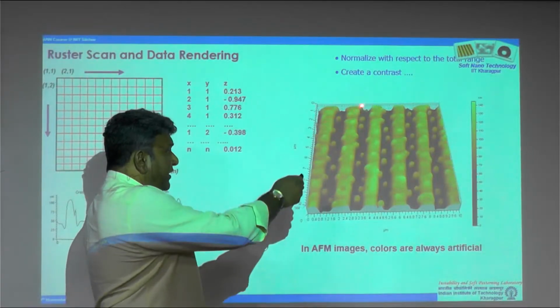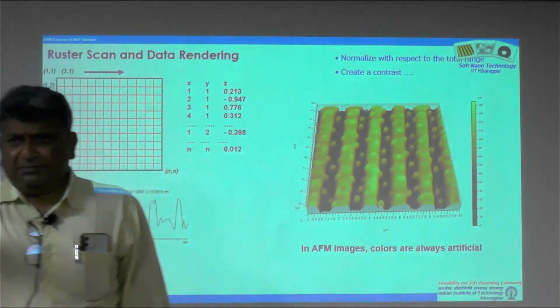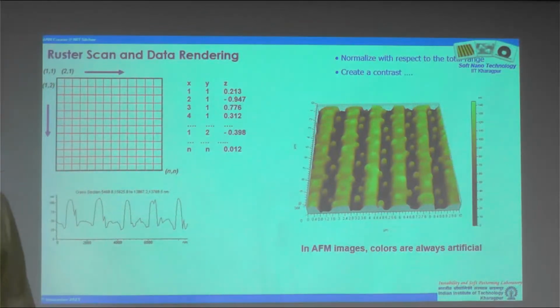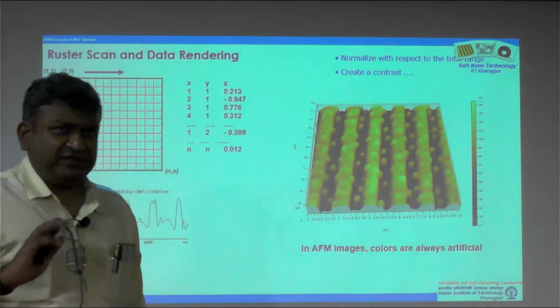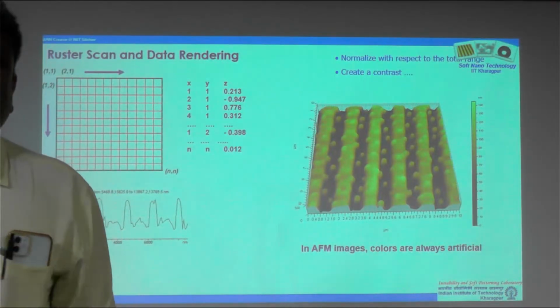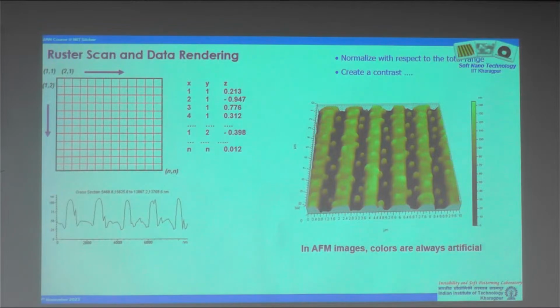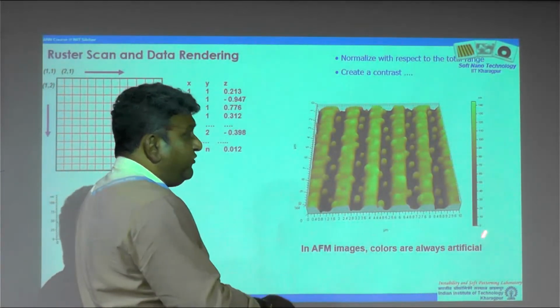Here again, if you look into the figure, you will intuitively have a feeling that there are some lines, right? And the black regions are something that is separating a grating structure or something. And there are some secondary depositions which have happened for some reason, which are like micro pillars or nano pillars or whatever. Any microscope would give you this information, but what other microscopes will not give you is that the height of the lines or whatever features you have is limited to about 140 nanometer.